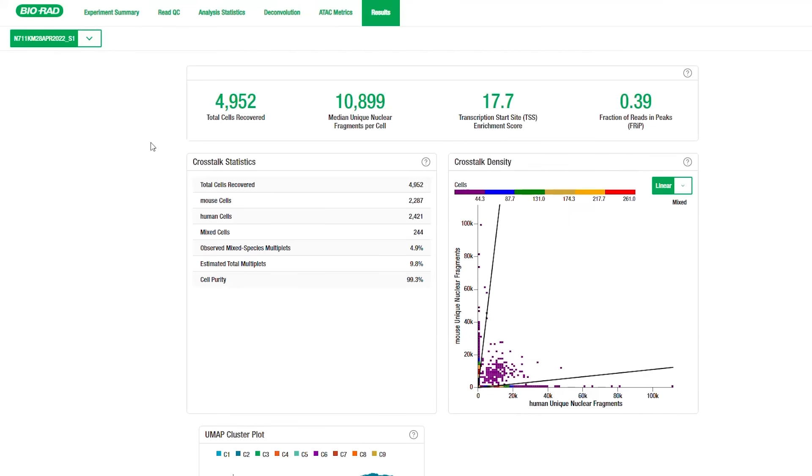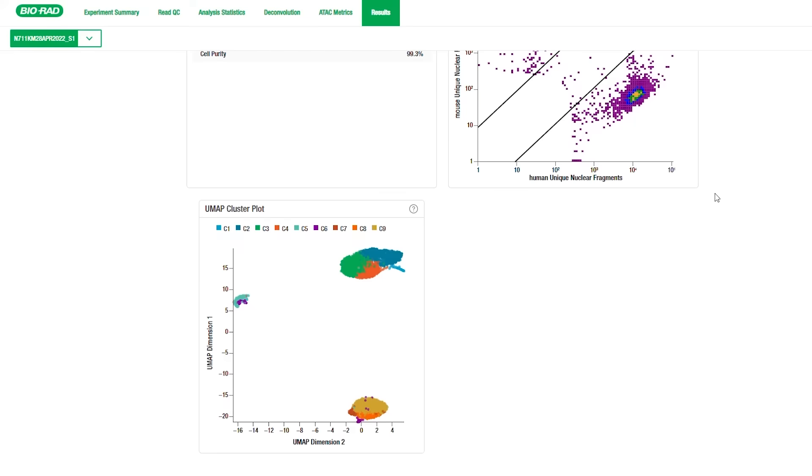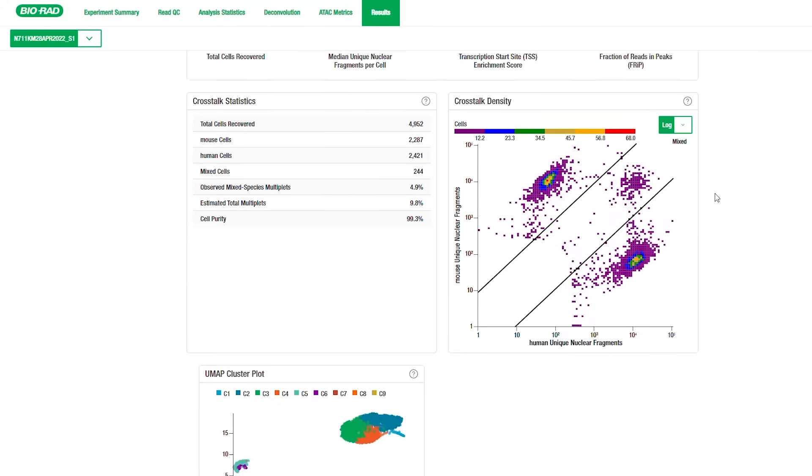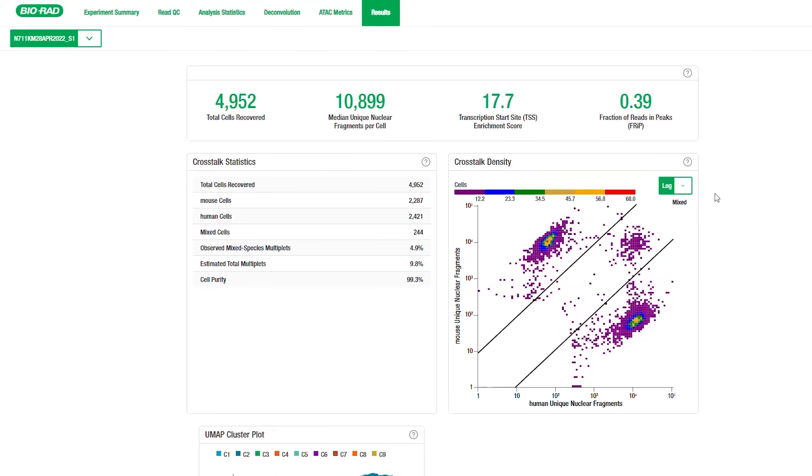The results tab provides a table that highlights key results for the experiment. It also includes a UMAP cluster plot for all the barcode containing nuclei. If your samples contained two species such as human and mouse, you would also have a table and a graph showing the crosstalk statistics, including the number of unique fragments identified for each species and those associated with both, otherwise known as the crosstalk. With all the information included in this report, the user can assess the quality of their data and performance of omniscient.